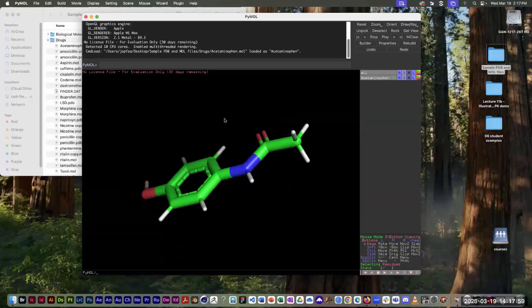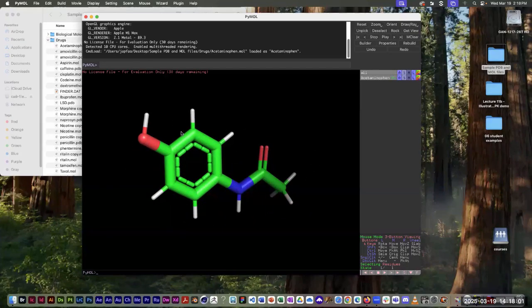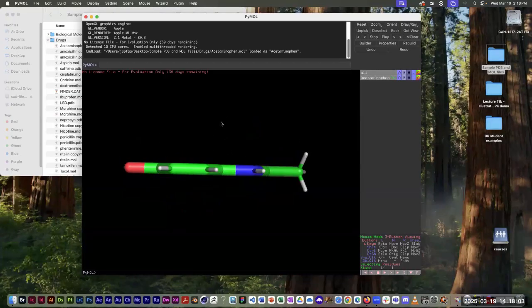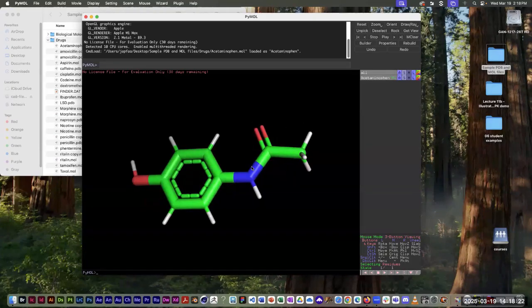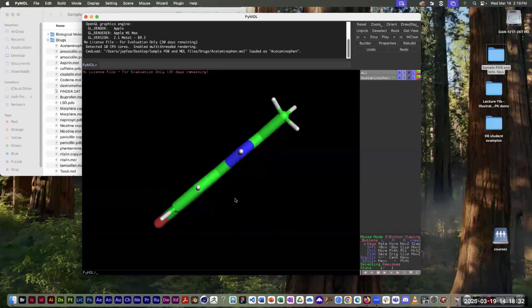I just realized something a little odd about this molecule. Do you notice anything weird about the molecule when I rotate it sideways? Completely flat. Now there are parts of this molecule that are flat. You recognize this symbol over here, the dotted lines. That tells me that's a benzene ring. That part of the molecule is actually flat. But this nitrogen right here, represented by that blue stick, should be adopting a pyramidal configuration. So the 3 bonds attached to that nitrogen should be a pyramid, and they're not.